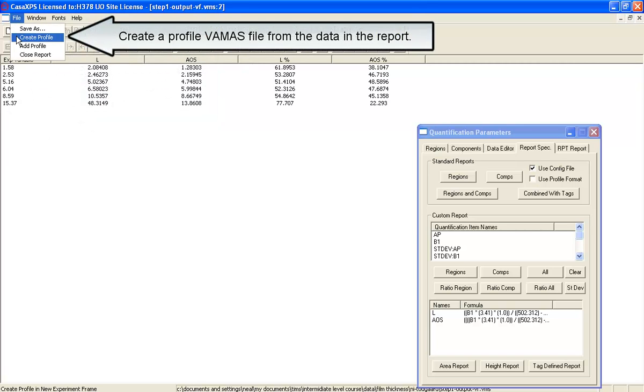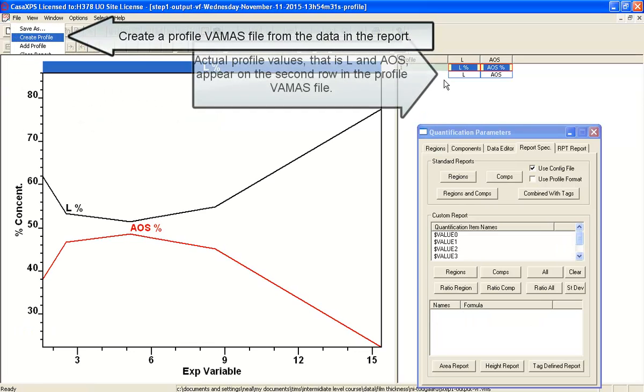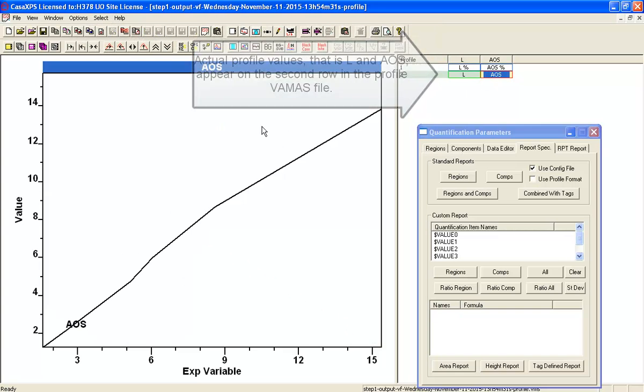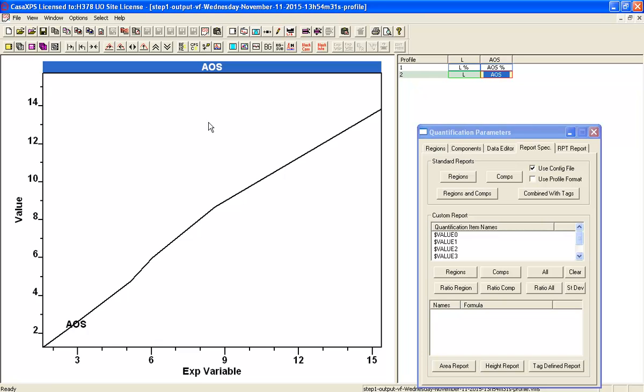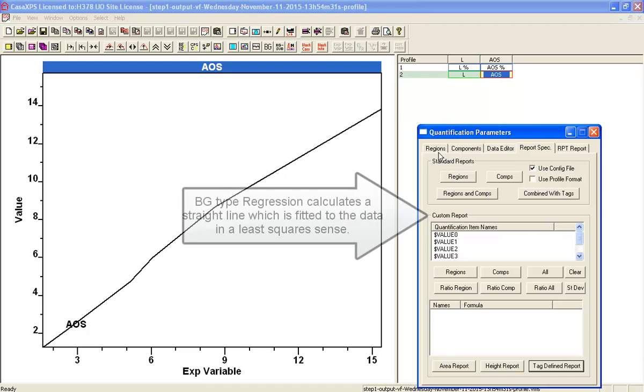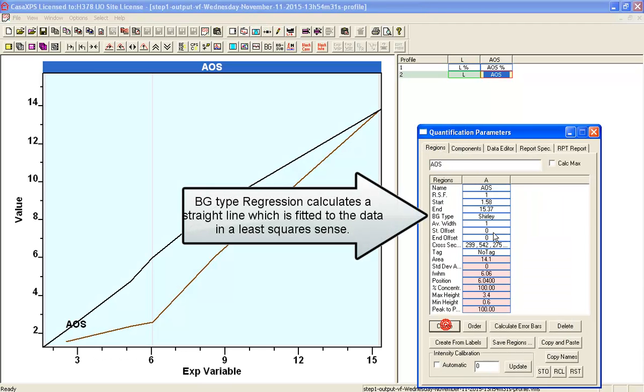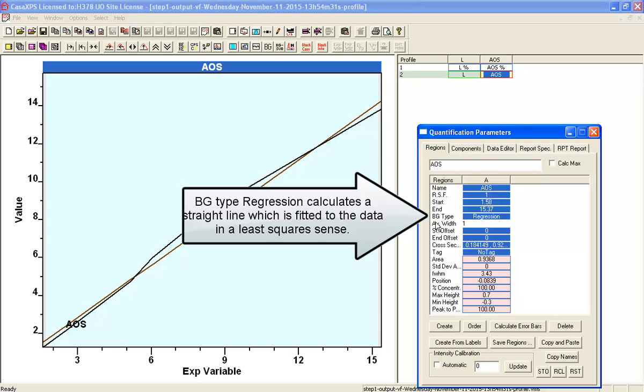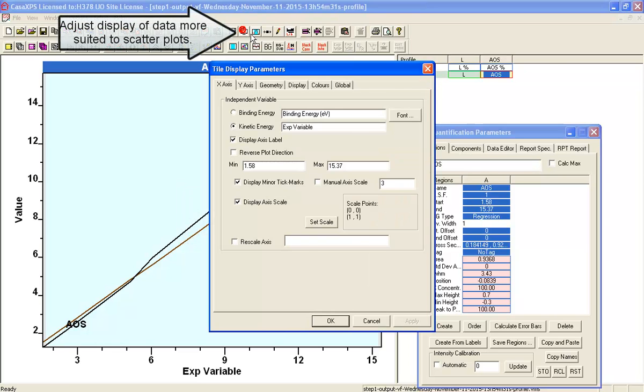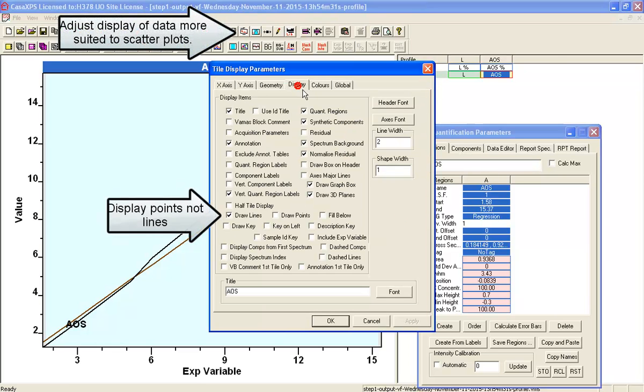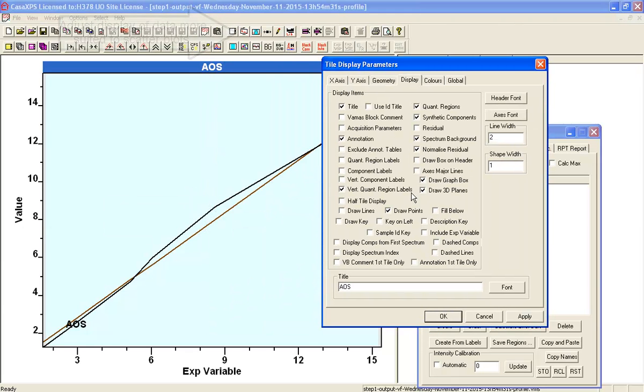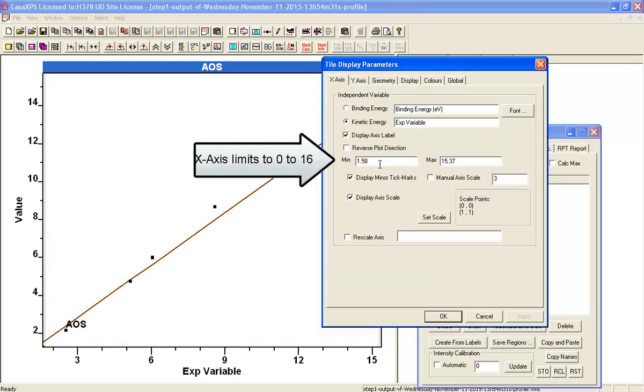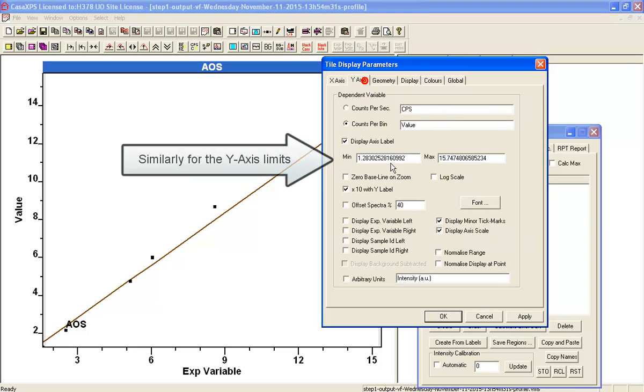So I'll create a profile and we'll look at the amount of substance which is related to film thickness. And I will add to this a region. I'll give it a regression type so we can see a straight line, and we'll just change the display so that we can see points for the data. And we'll turn off the region display. And we'll just set the X value to 0 to say 16, and the Y value similarly, we'll set that to 0 to 16.